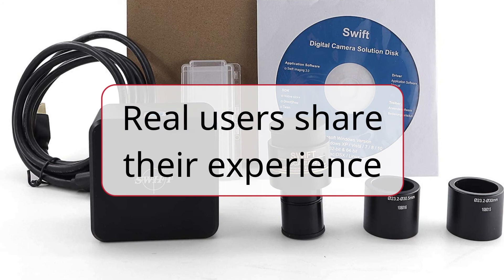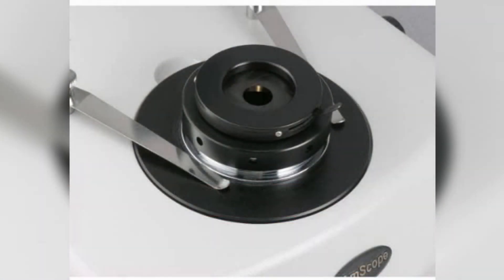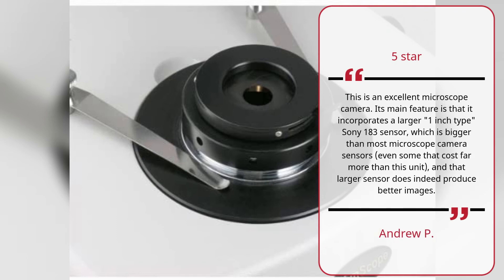Real users share their experience. This is an excellent microscope camera rated 5 stars. Its main feature is that it incorporates a larger 1-inch type Sony 183 sensor, which is bigger than most microscope camera sensors — even some that cost far more than this unit — and that larger sensor does indeed produce better images.